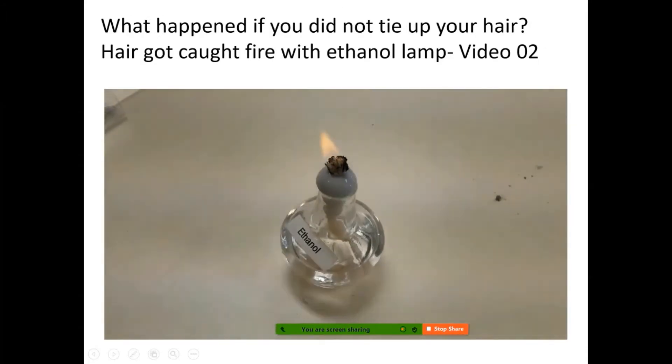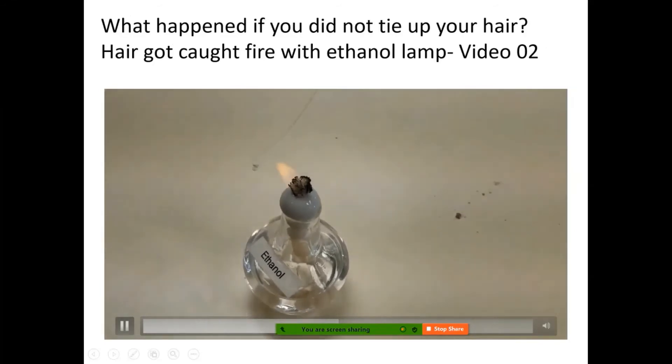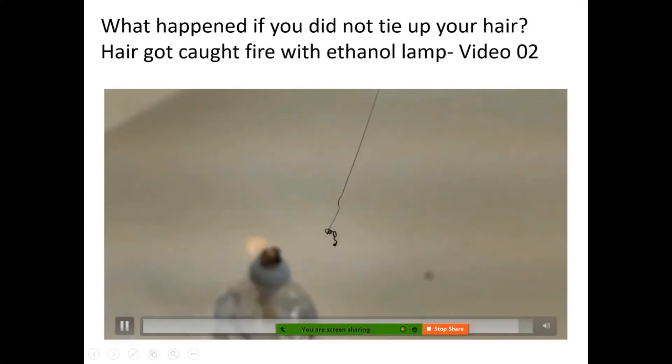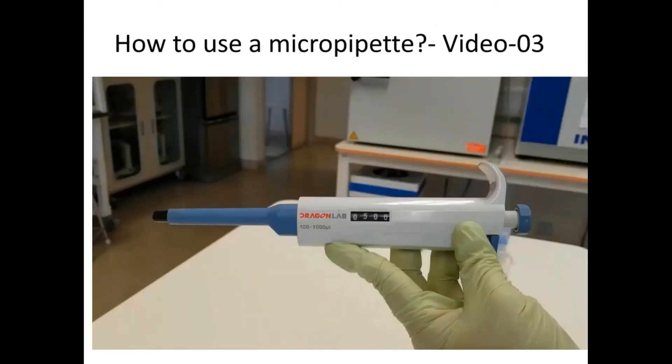So what would happen if you did not tie up your hair? The hair burns very quickly and it's very crispy. Make sure you really tie up your hair when working with the ethanol lamp. It's very important that you don't have your hair caught on fire. Safety comes first.